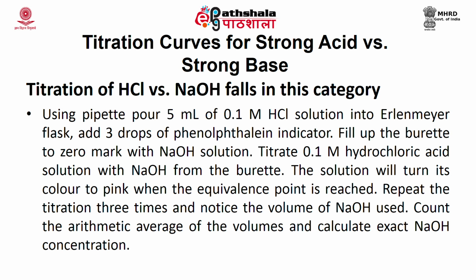The solution will turn its color to pink when the equivalence point is reached. Repeat the titration 3 times and note the volume of NaOH used. Calculate the arithmetic average of the volume and calculate the exact NaOH concentration according to the equations given below.